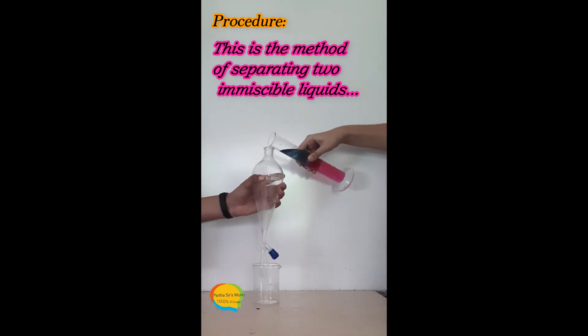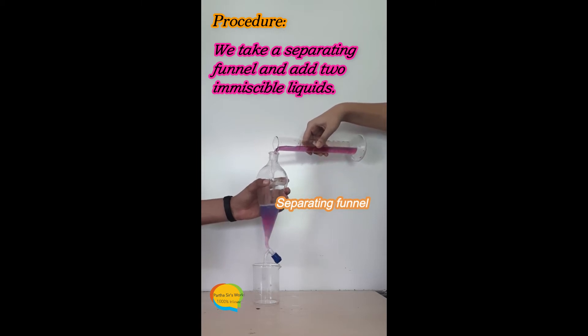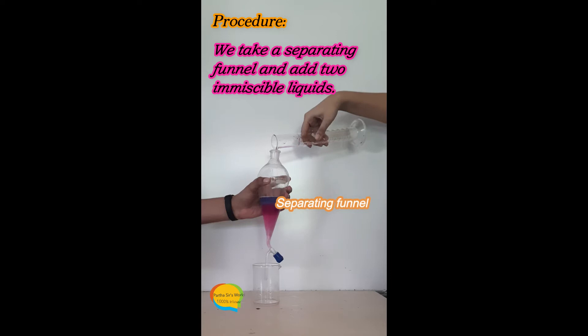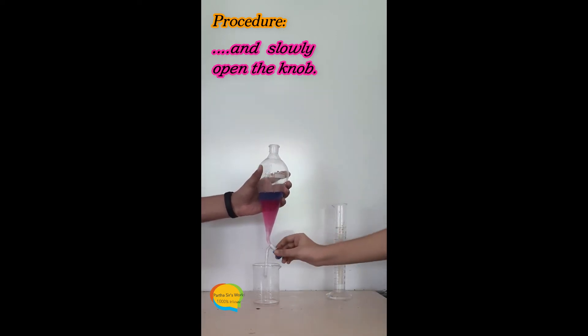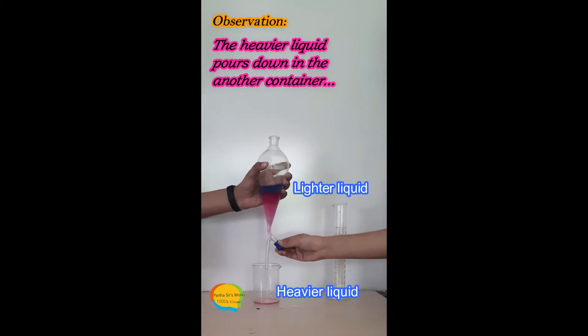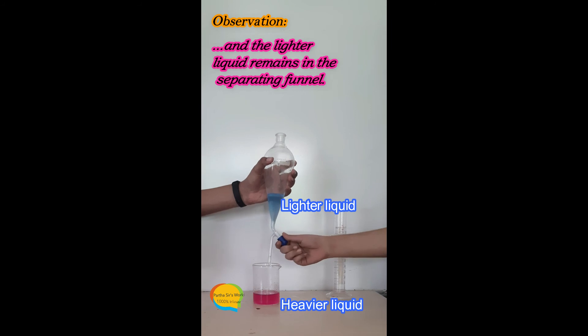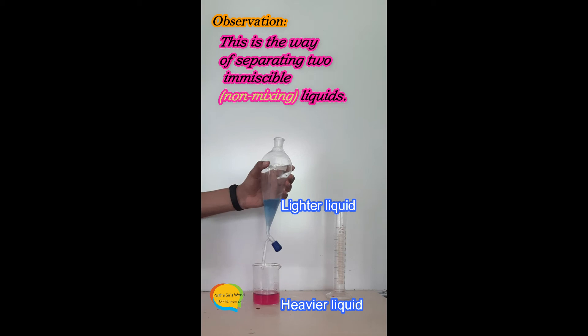This is the method of separating two immiscible liquids. We take a separating funnel and add two immiscible liquids, then slowly open the knob. The heavier liquid falls down into another container, and the lighter liquid remains in the separating funnel. This is the way of separating two immiscible liquids.